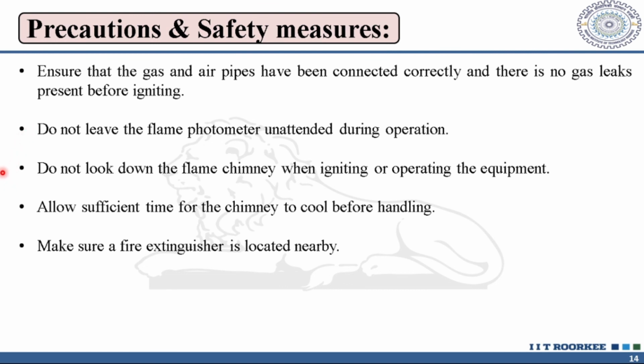Now this is very important. Don't look down the flame chimney when igniting or operating the equipment. Allow sufficient time for the chimney to cool before handling and make sure a fire extinguisher is located nearby that can be used in case of emergency.